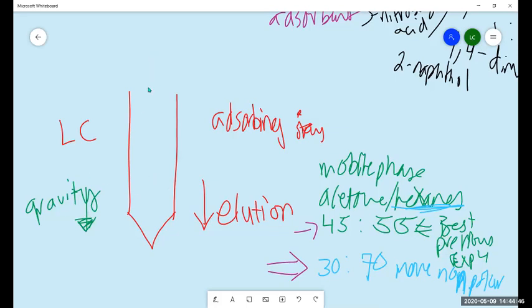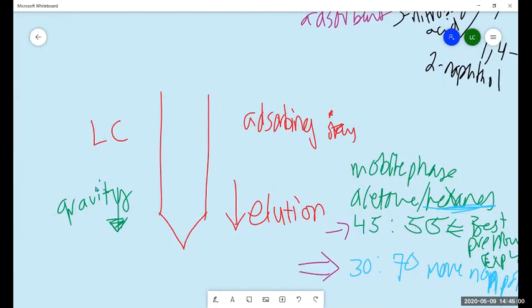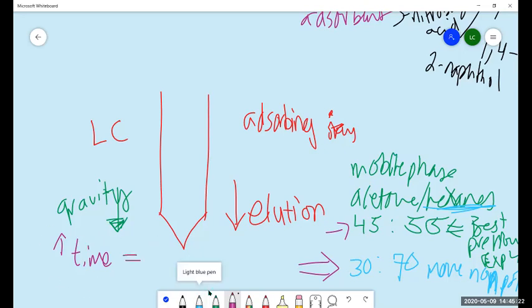Gravity just has that same impact. It treats everything equally, kind of like a curve. Maybe you're excited for a curve for the class, but a curve impacts everybody the same. Basically gravity is applied to everything, so everything gets pushed down faster, and it speeds up everything. And here you don't want it to speed up. If you imagine pushing everything down in 1 second, you're not going to get a separation, but you want more time to be able to get a better separation.